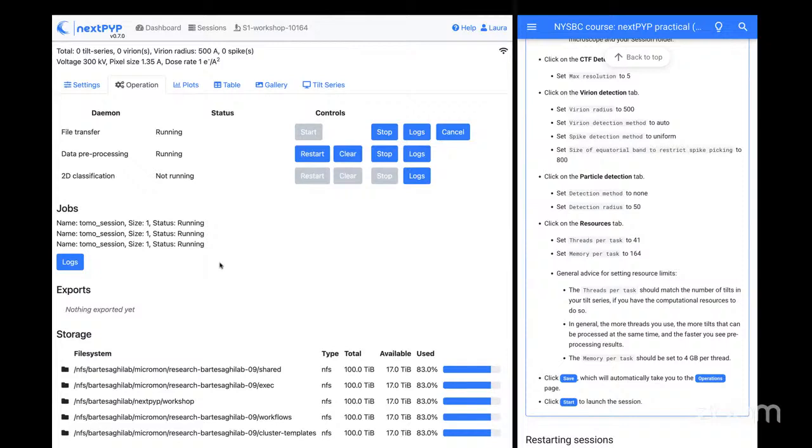Right. If you pick the move option, you can think of it like a funnel: you have things coming in, but you also have things coming out. If the speed at which your images arrive at your microscope is at least roughly equal to the speed at which data gets transferred out, then you're at a sort of constant rate of storage, I would say. I don't think copying from your microscope computer to your local computer is so intensive an operation that you would see a slowdown in performance at the microscope, if that's your question.